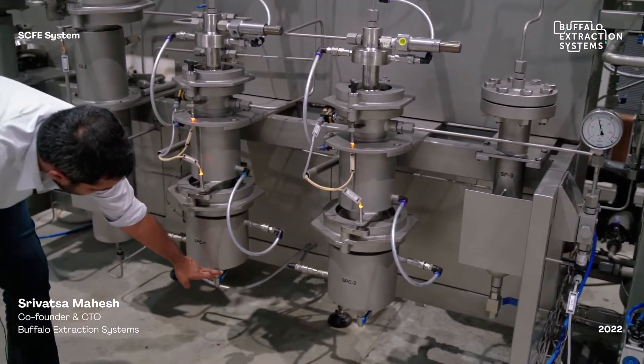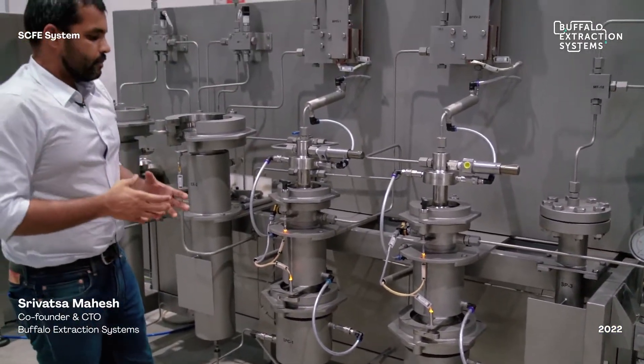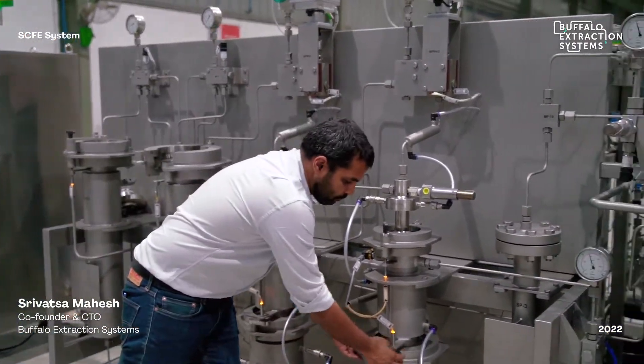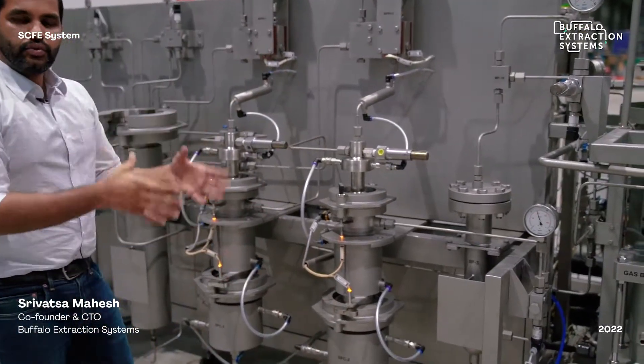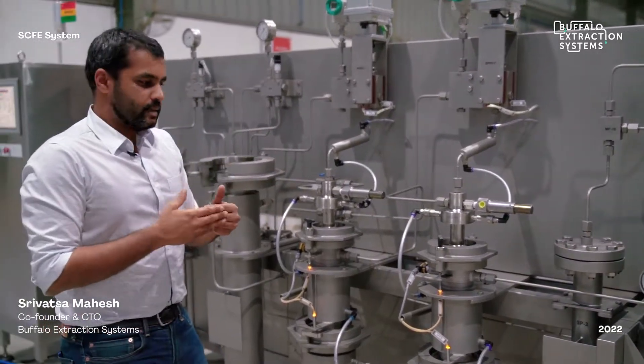Both collection vessels have a valve that can be used to open and collect the oils, and they also have a detachable bottom which can be used to collect all the fatty parts and ensure complete collection of the oil.